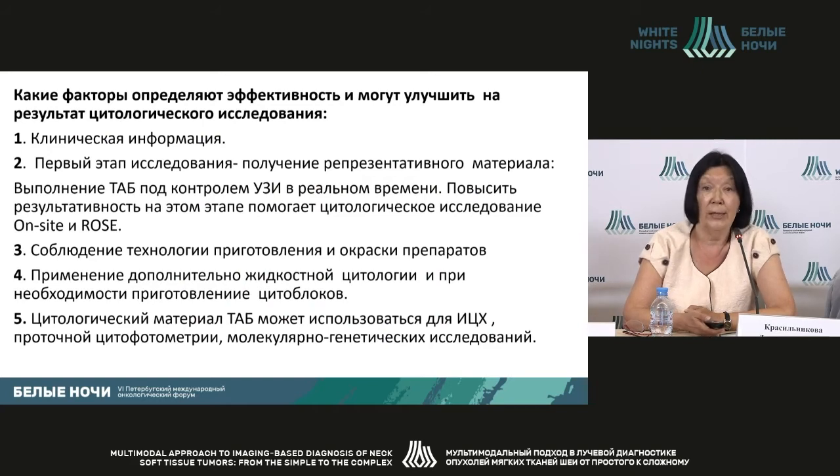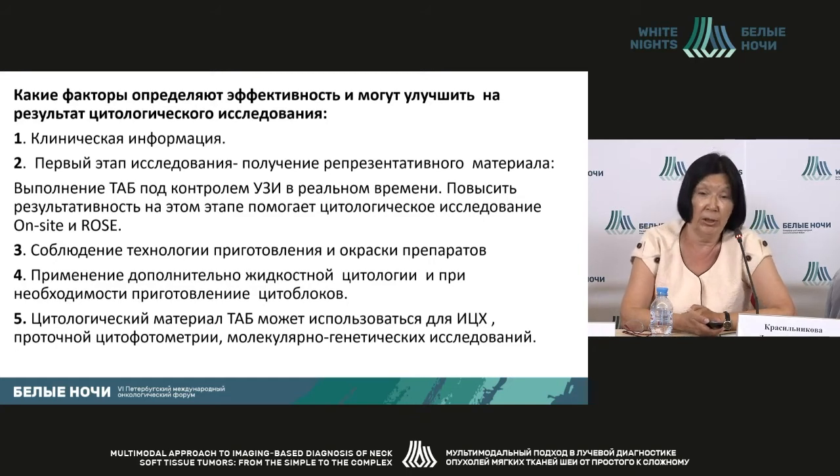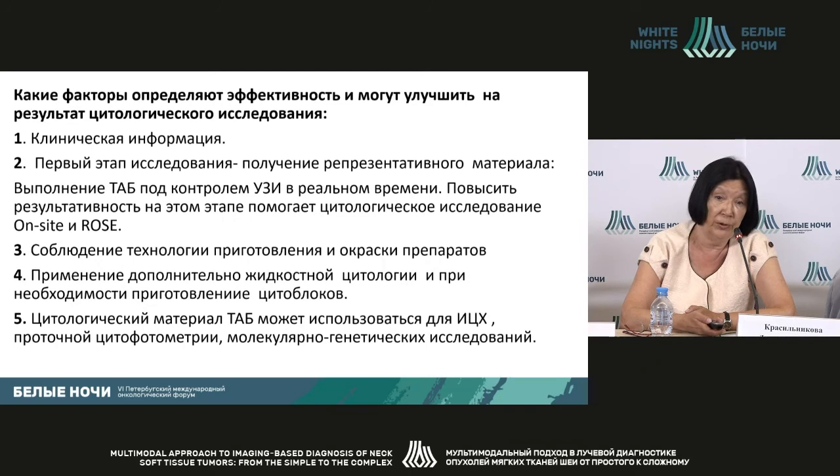As for the dyeing, let me add that dyeing is done two ways. In Russia, they use the Leishman or Romanovsky method, and there's also the most popular method in the West. This is the Papanicolaou method. These two methods of dyeing are common all over the world, and each method has its pros, and they may add up to each other.